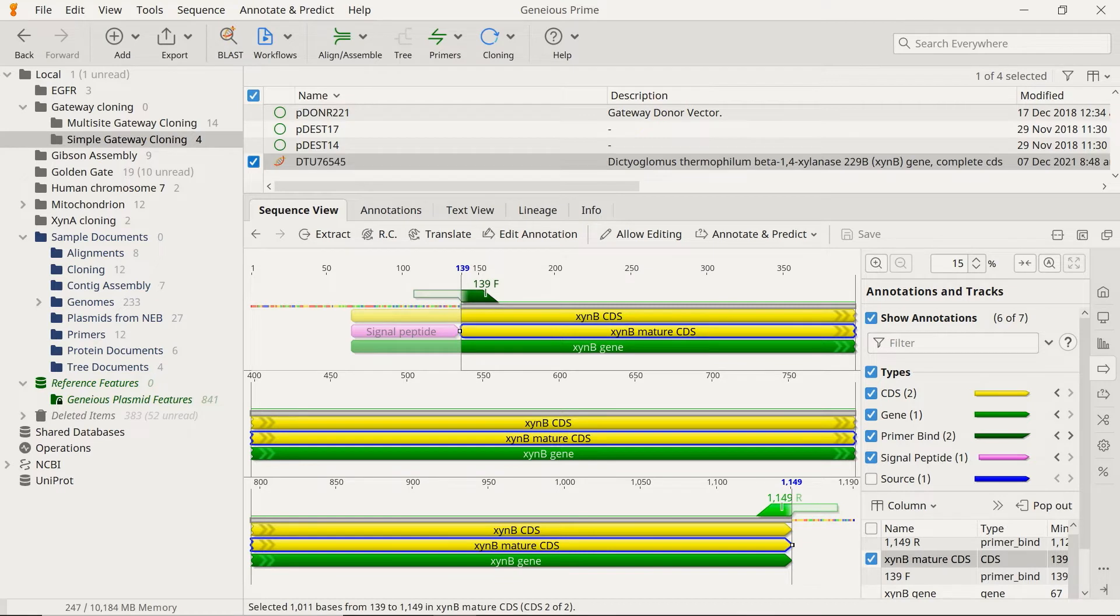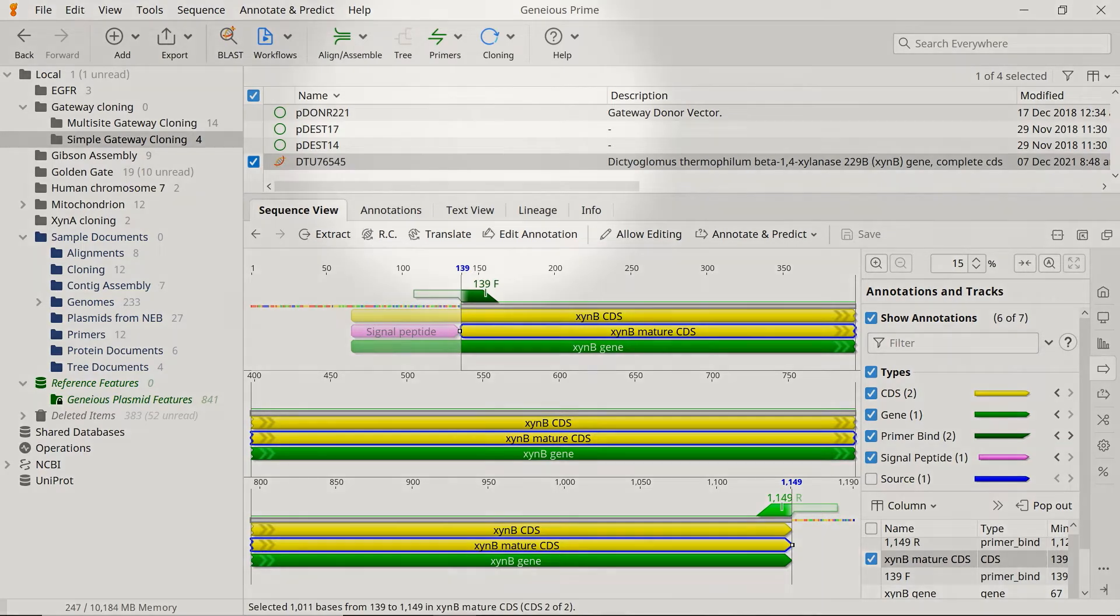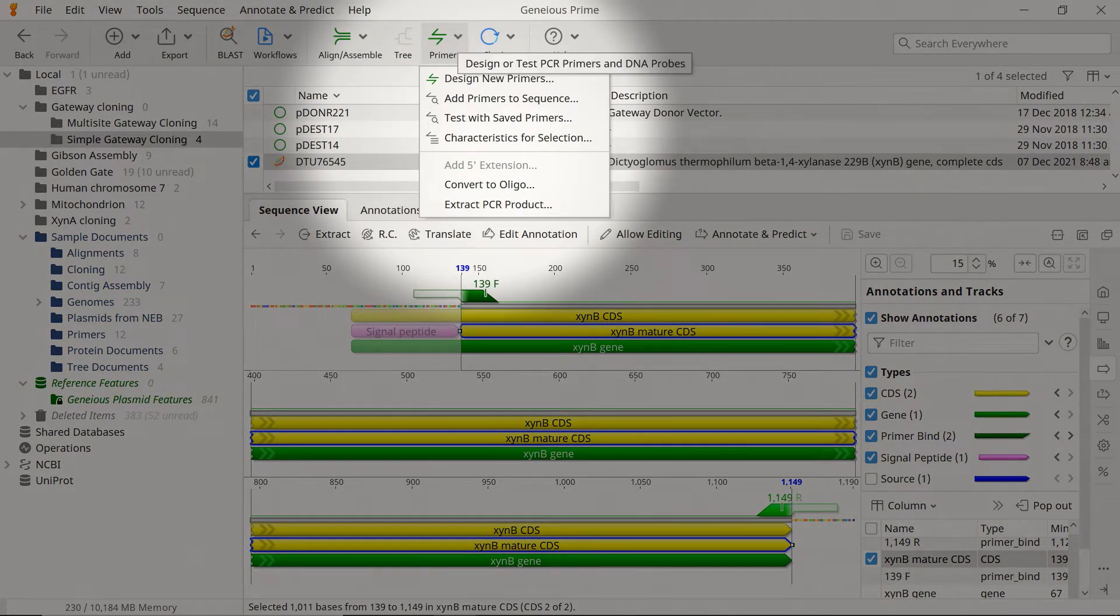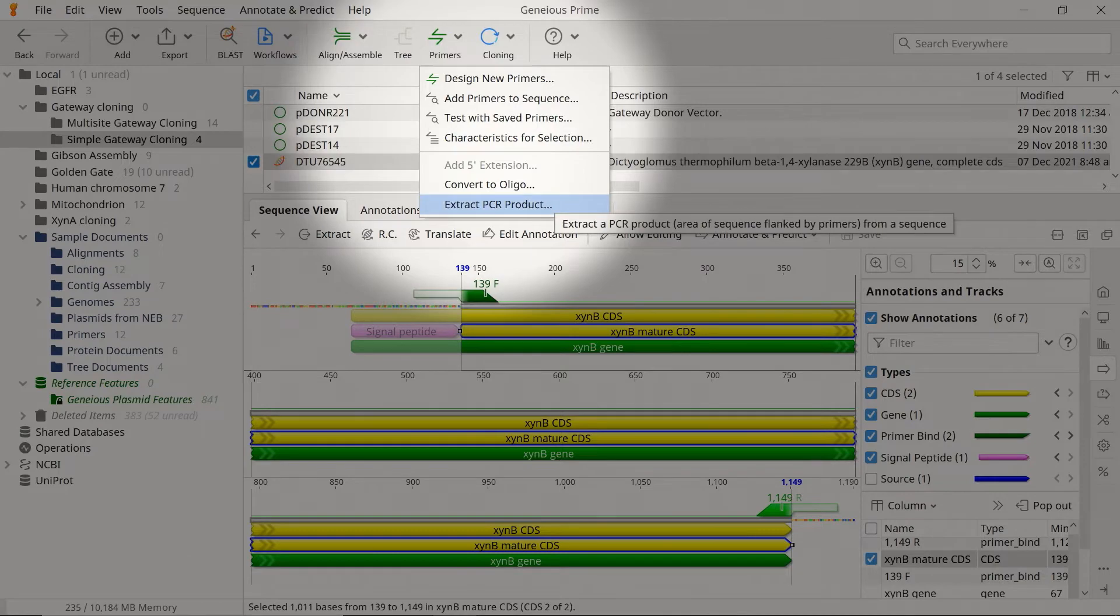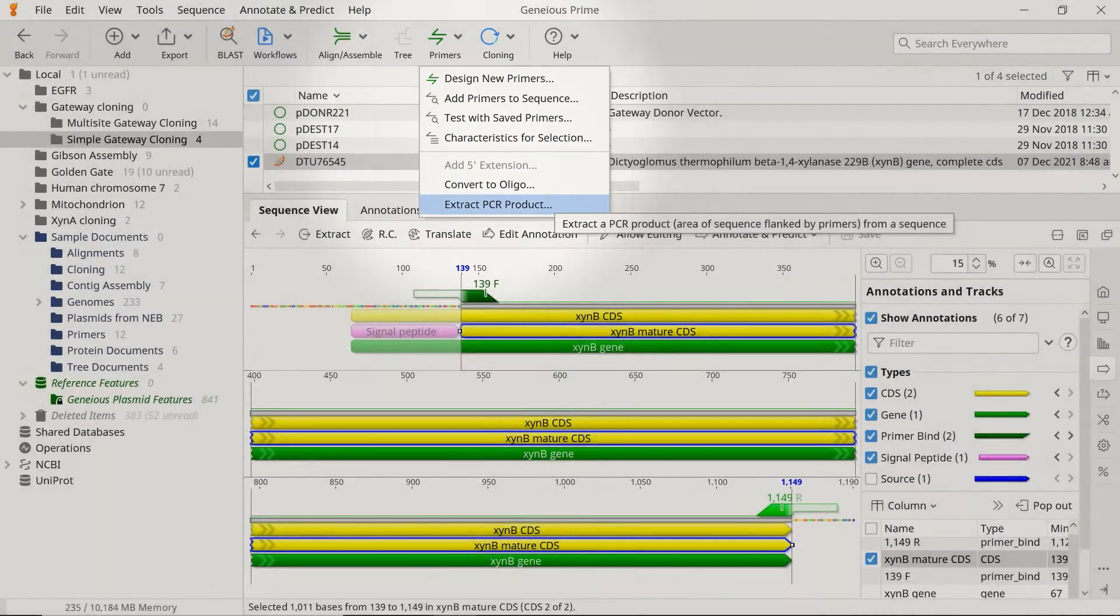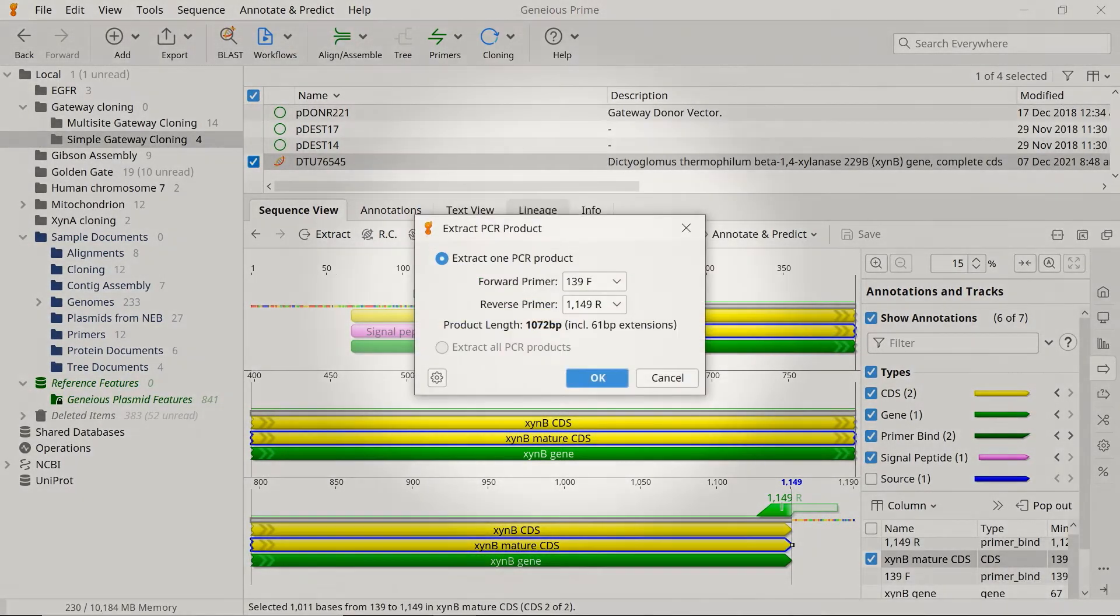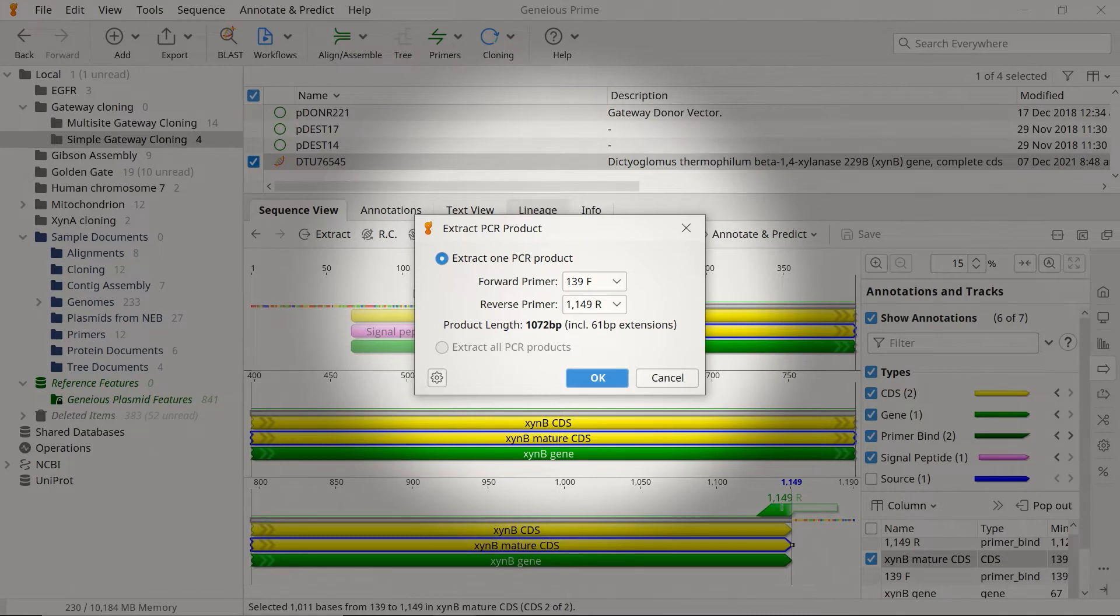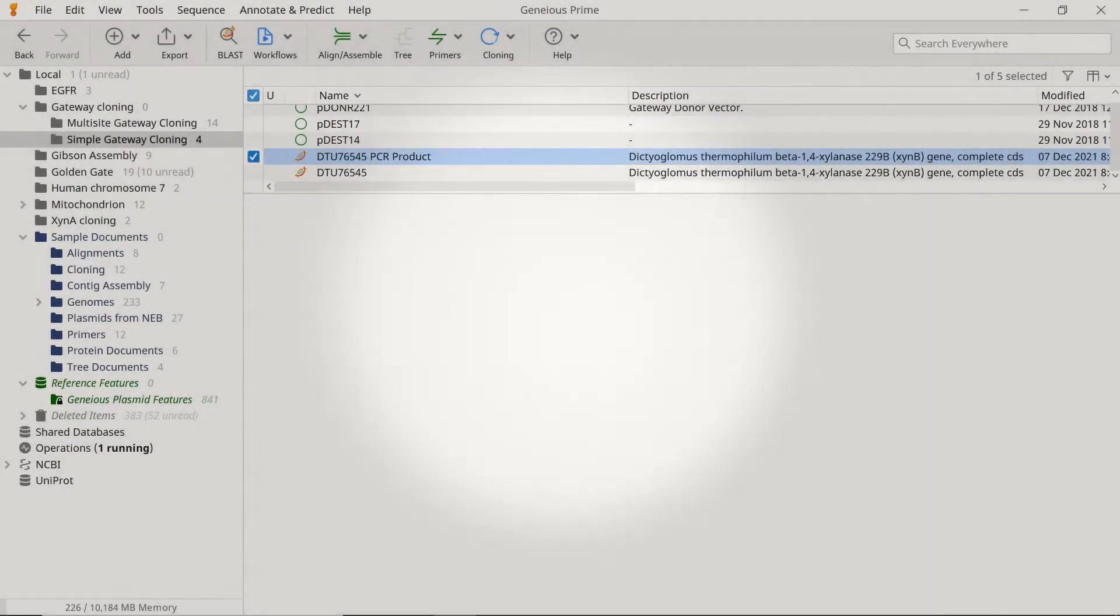With the primers designed, let's simulate a PCR to extract the region flanked by the new primers. Go to the Primers button, and choose Extract PCR Product. Use the drop-down menus to select the primers you designed earlier, and click OK to extract the product.